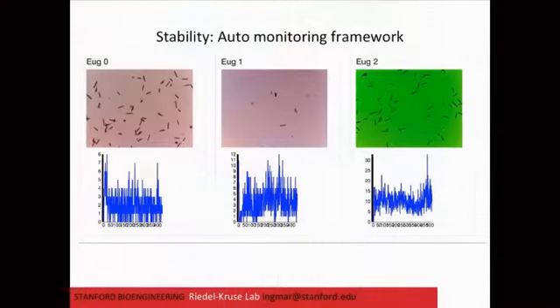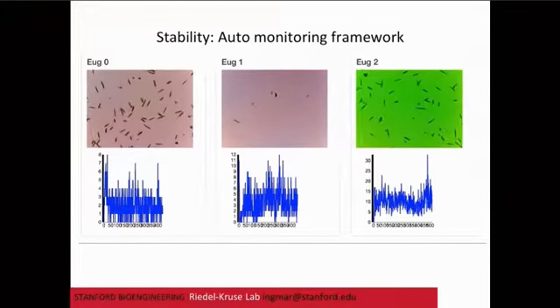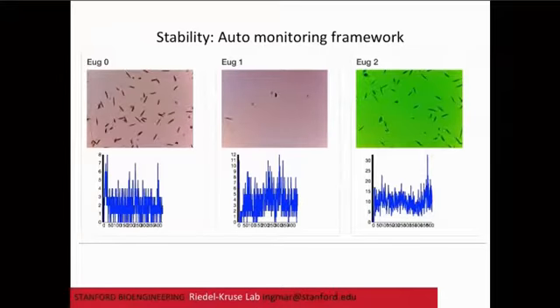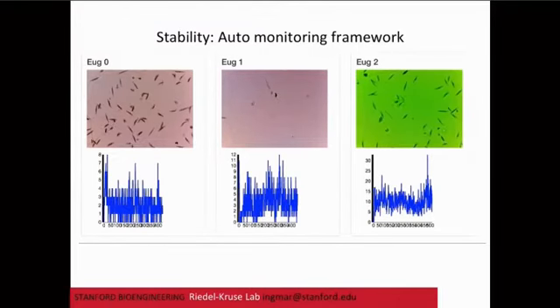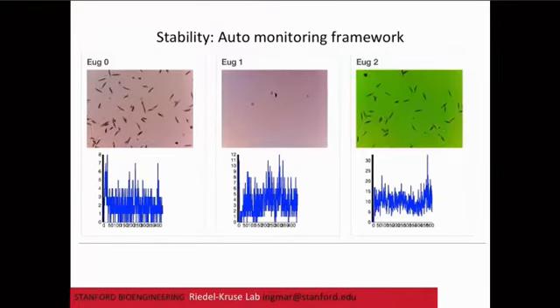With any sort of cloud system, you need to maintain it and monitor what's going on. We have that. But there's a special aspect here to the biology that you don't see in any normal electronic or computation cloud lab, and that's the organisms themselves, which may for some reason not respond as well, or be dead. For example, in this middle machine here, there are not that many cells.